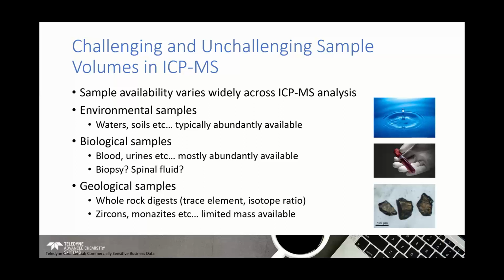Geological samples, a similar situation. In a lot of cases, if you did a whole rock digest, for example, you would still have a lot of material to work with. If you did a digest of a whole rock, if you're interested in trace element analysis generally, or isotope ratio work, you might have a lot of material to work with.